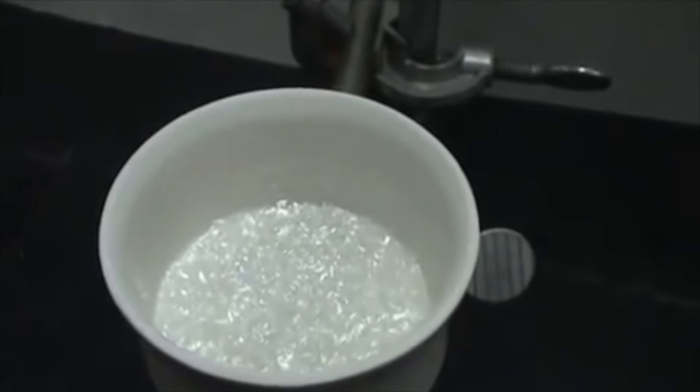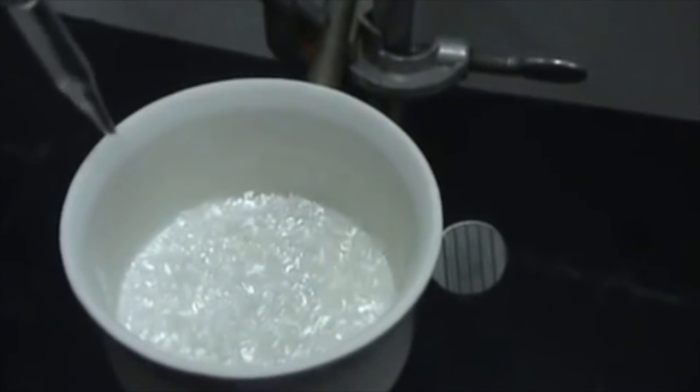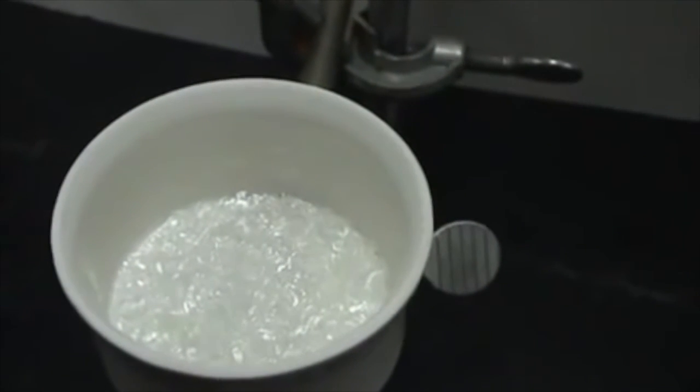Finally, we initiate the crystal drying process by pulling air through them for a few minutes.